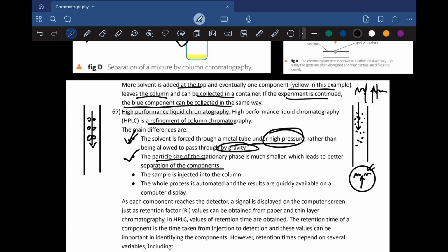Let's say your friend has a greater weight than you, so you will be traveling more quickly between these small and narrow trees, but your friend will face more difficulties traveling through these narrow spaces. This will make the separation. Otherwise, if there was a much bigger space, then you both could have traveled at the same speed. So this is how we'll be able to separate the components between you and your friend. This is how we'll be able to separate them.